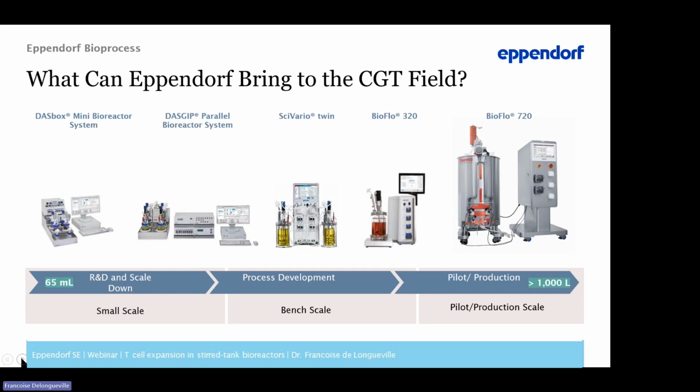Optimized protocols for the scalable manufacturing of T cells are crucial, since T cells and other lymphocytes require meticulous culture conditions. They are highly sensitive to their culture environment and can react easily by modifying their receptor ligand repertoire, which can cause changes in cellular response to external substances.